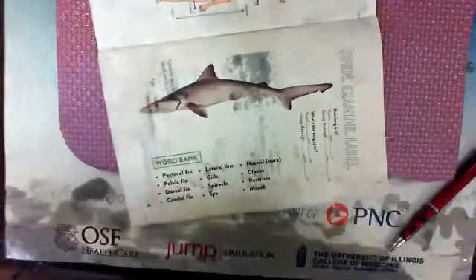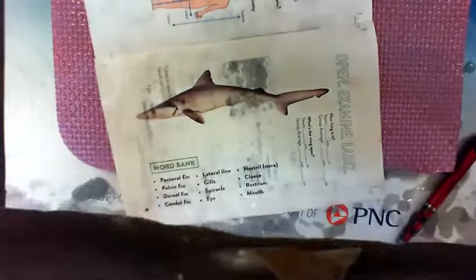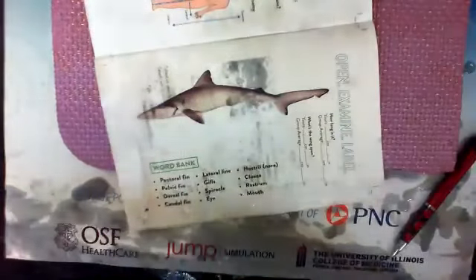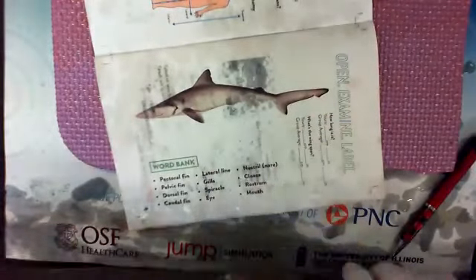It's kind of interesting. The fins are primarily for steering and balance, to keep them from spinning, like a torpedo. If you didn't have the fins, they'd just keep spinning around in circles, right? And they're minimally for propelling or moving forward. Most of the propulsion is actually because of the muscles, and we'll talk about that. This is more like a rudder on a boat that helps steer the boat. All right, so we talked about the pectoral fins and the dorsal fins.